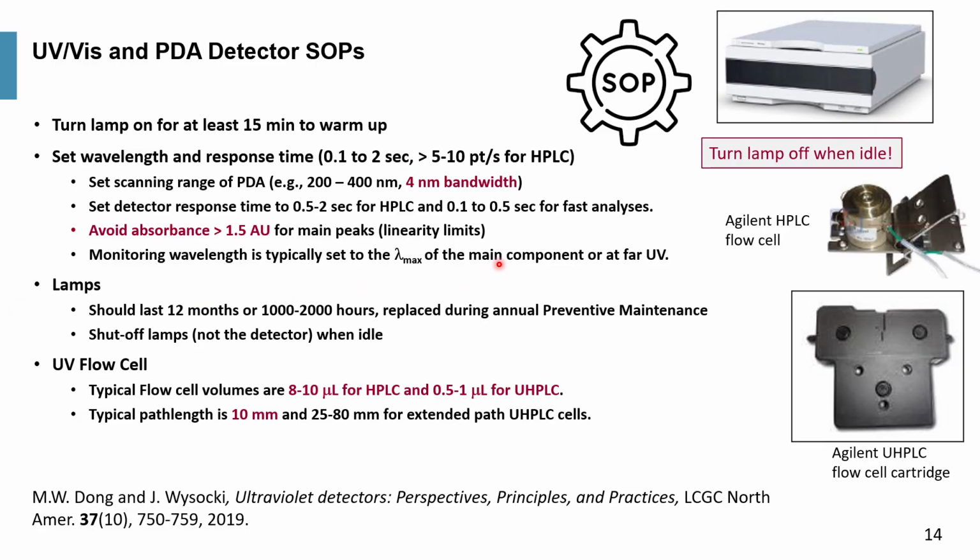If you have faster peaks in UHPLC, make sure that your detector response time is commensurate with the peak width of the eluting peak.